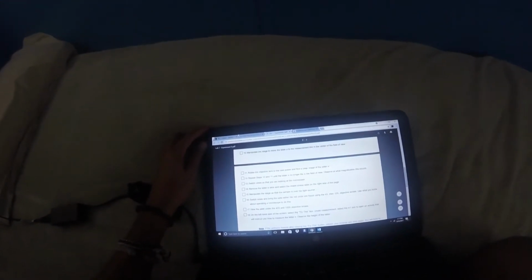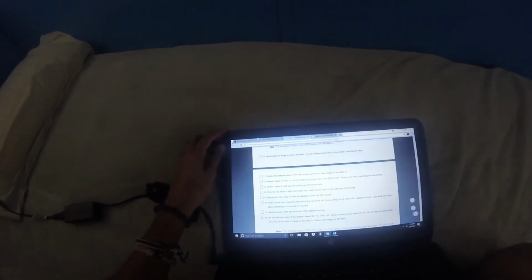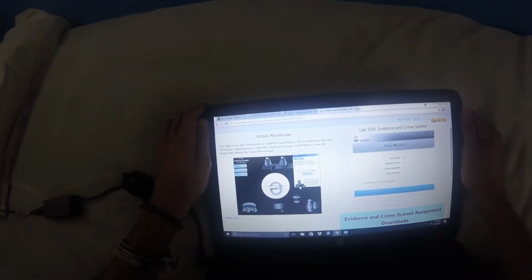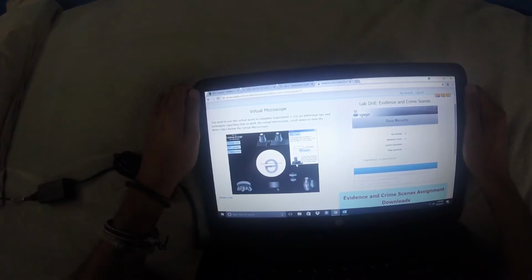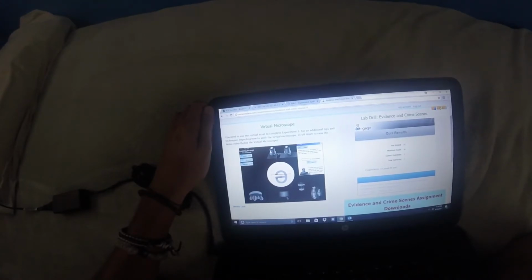Alright. On the left hand side of the screen, select the try this box under measurements, then select the M1 box to open an activity that will instruct you on how to measure the letter E. Observe the height of the letter. Okay, so hit the try this and select the M1 box. If each microscope unit equals 10 micrometers at this magnification, how tall is the letter E? Top to bottom. So rotate your micrometer, drag the cursor on the top cap in a circular motion.